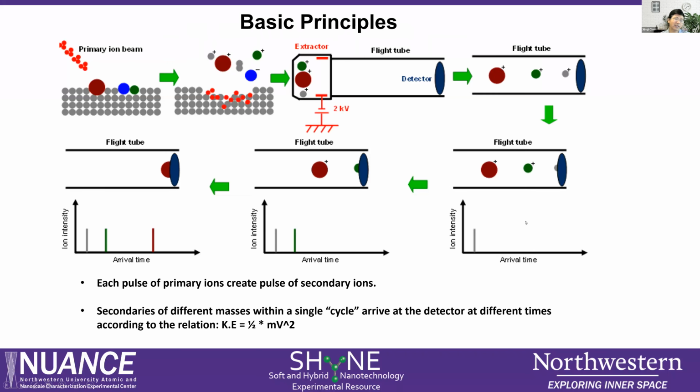So I give you a sense, because some people say, why didn't you buy the nano SIMS like Stanford? They have that. But first of all, that is 3 times more expensive than our current ToF SIMS. Second, that one is not for surface analysis. It is for depth profiles, for some biosamples, for mapping. It is not that surface sensitive like our ToF SIMS. So we are more focused on the surface.